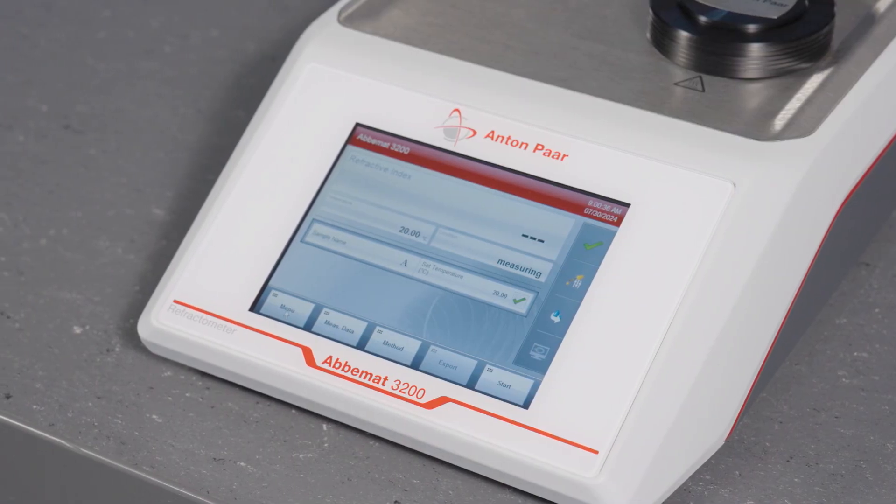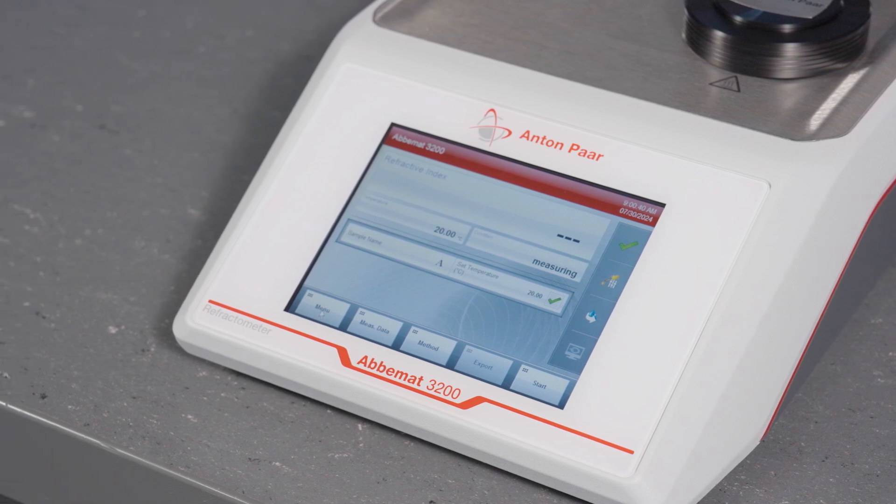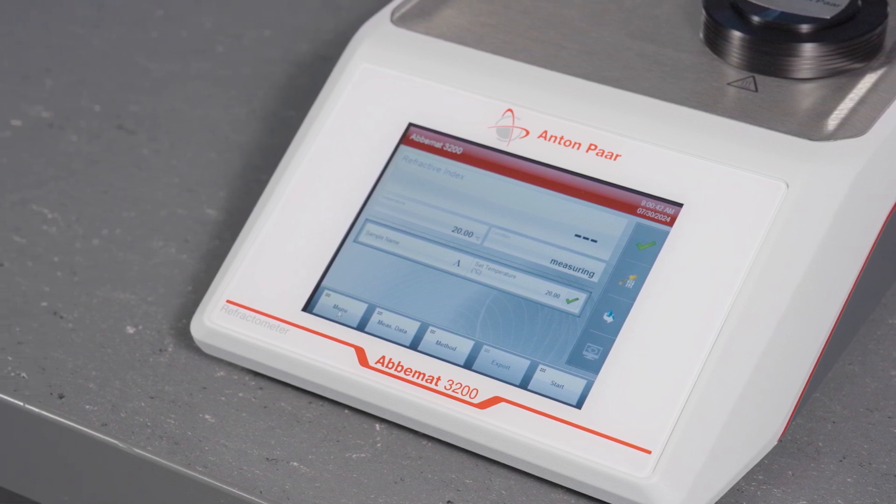In this video, we will show you how to start and operate the ABIMAT 3000, 3100, and 3200 refractometers.